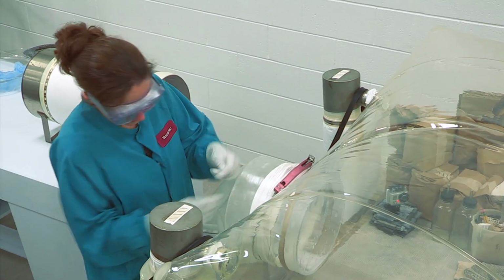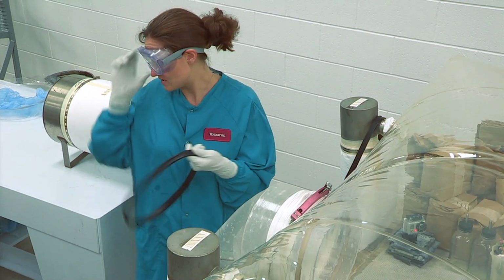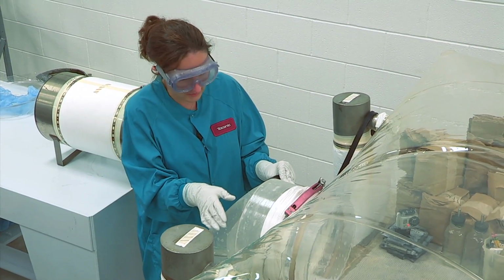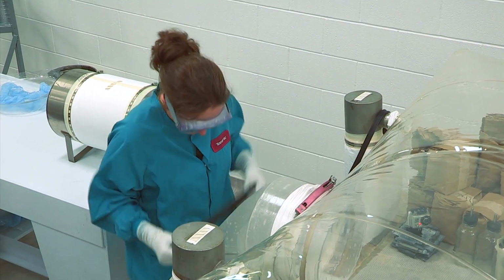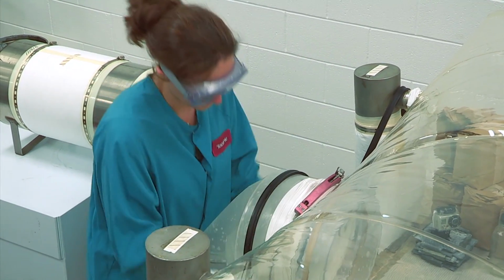Now we secure these to our port using a clamp and band. You can also use the 2-inch vinyl tape by drying off the sleeve, and we usually go around 1.5 to 2 times, making sure that there aren't any channels of entry for the air to come through. But tape, especially on a port, can be very difficult, so these clamps are really handy.